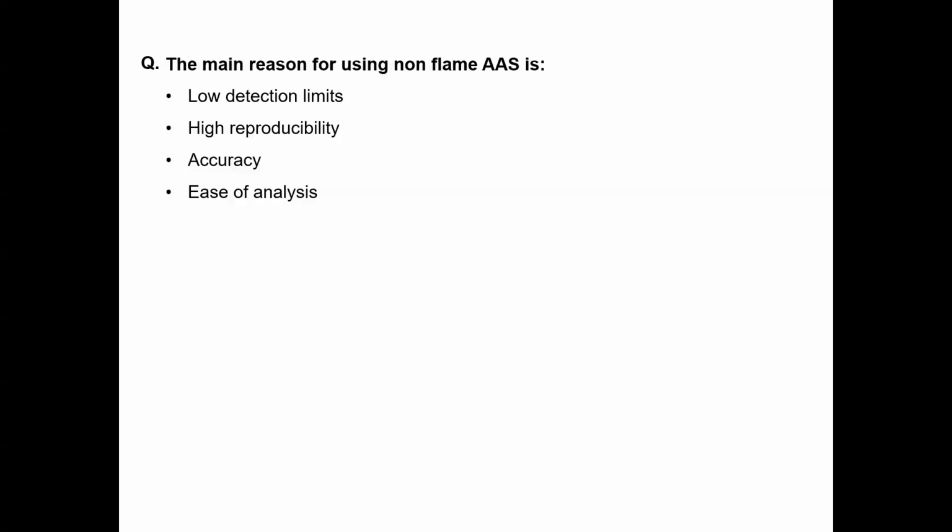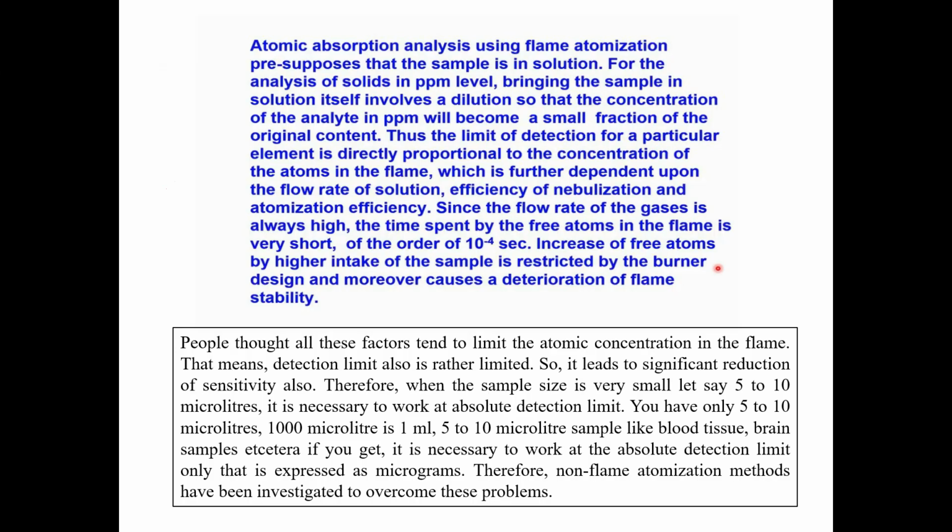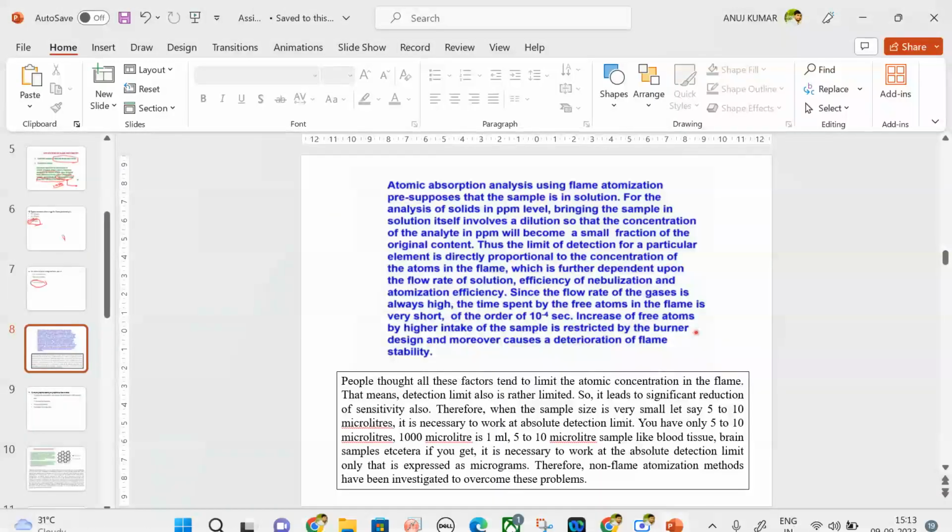Or they are very easy in the analysis, easy to operate. Okay, so atomic absorption analysis using flame atomization.